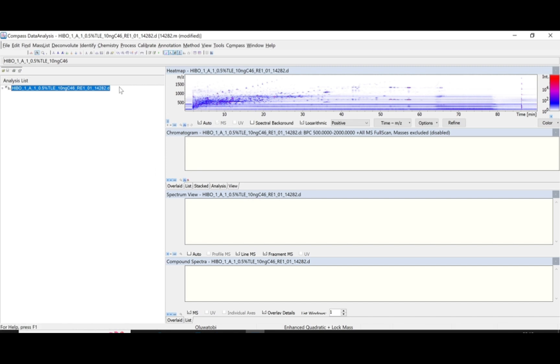To the right of my sample is the heat map. The heat map visualizes the different compounds present in the sample. On the y-axis of the heat map is the mass, and on the x-axis is the retention time.